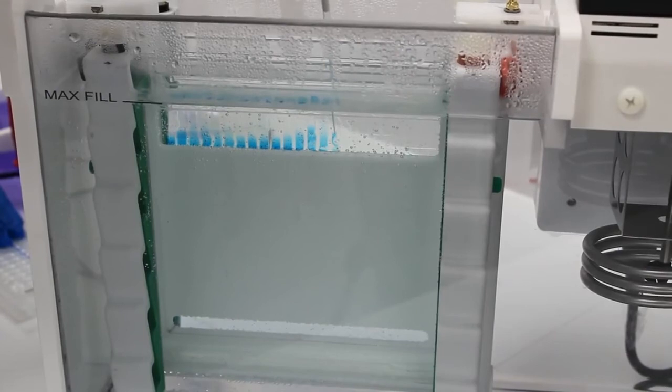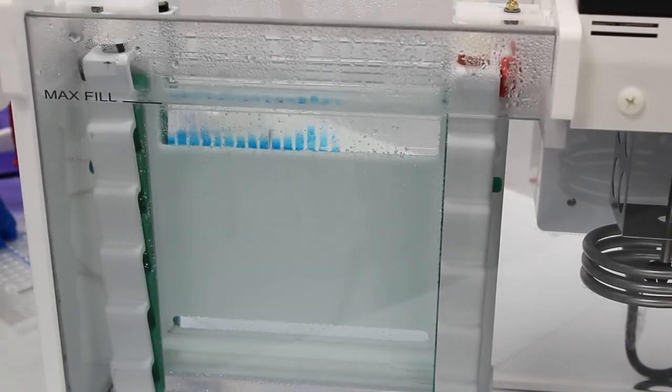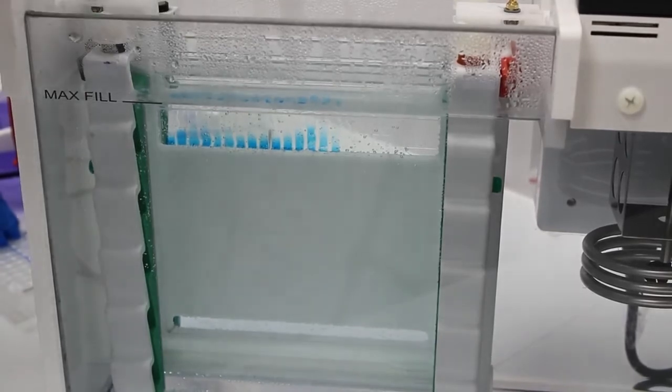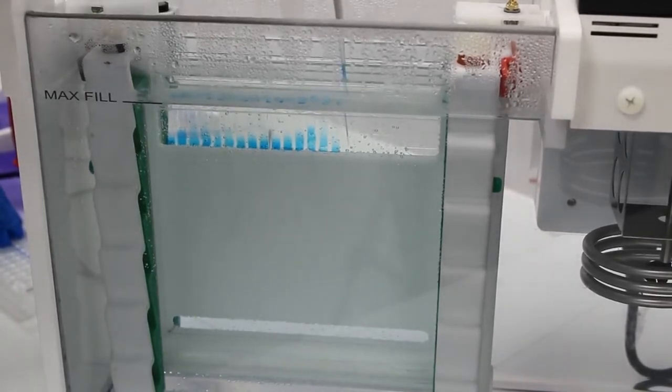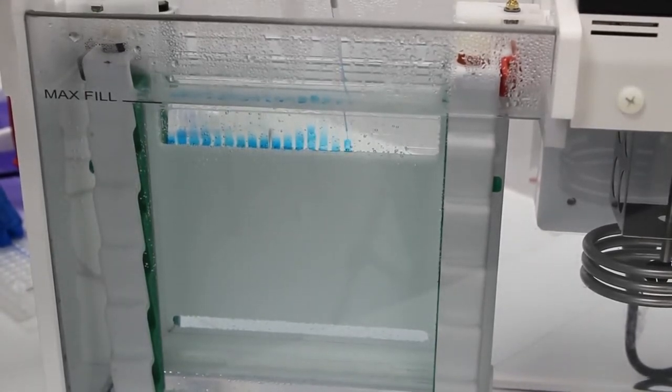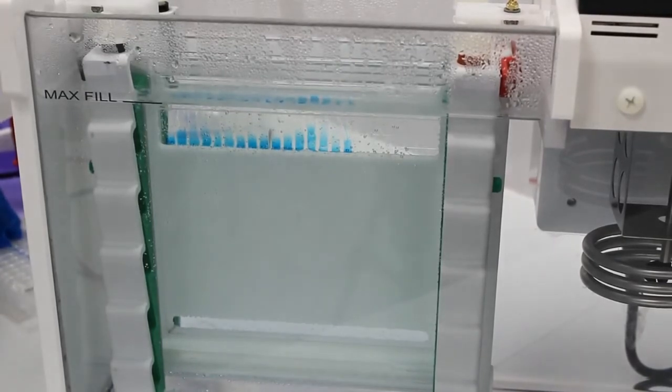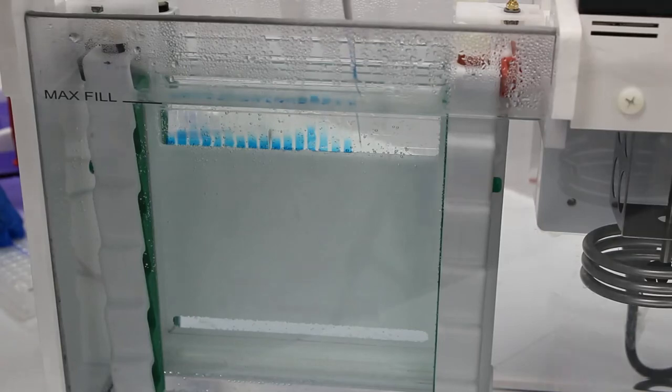So once you've finished loading all of the DNA on one side you can just carry on loading on the other side and then connect the lid back to the tank. Connect the cables from the lid to the power pack and then start the gel run.